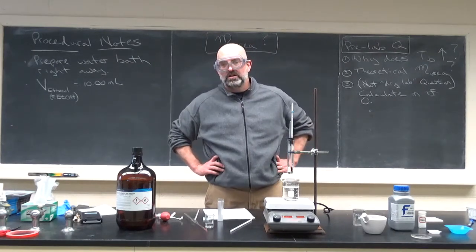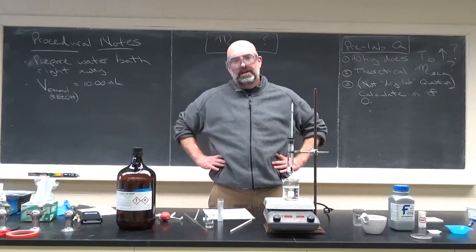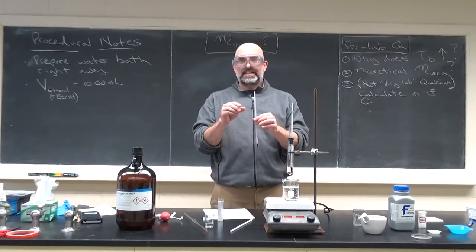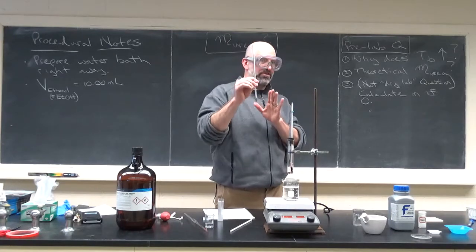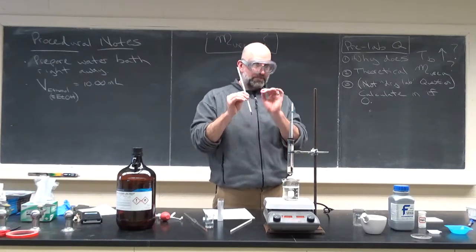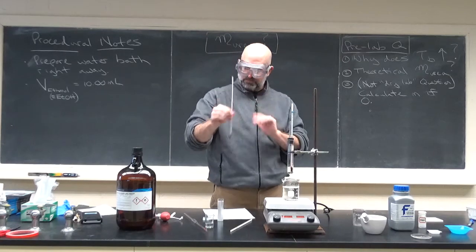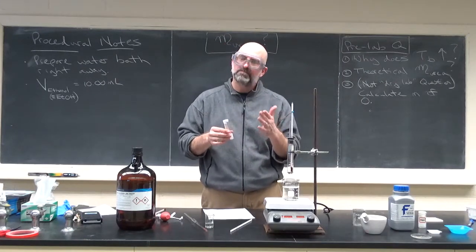Which also begs the question, why are we measuring the boiling point of ethanol when we have it? We can just look it up in a book. Well, that's because thermometers are not perfect. These lab thermometers are definitely not perfect. So to calculate a delta T, which is what we want to do with the math, we use the same thermometer. We have a boiling point with an imperfect thermometer of ethanol, and then a boiling point with an imperfect thermometer of ethanol with urea in it, so that we take away the systematic error in the thermometer. That's a very important experimental point. You wouldn't normally think about that with thermometers as an instrument, but they are.